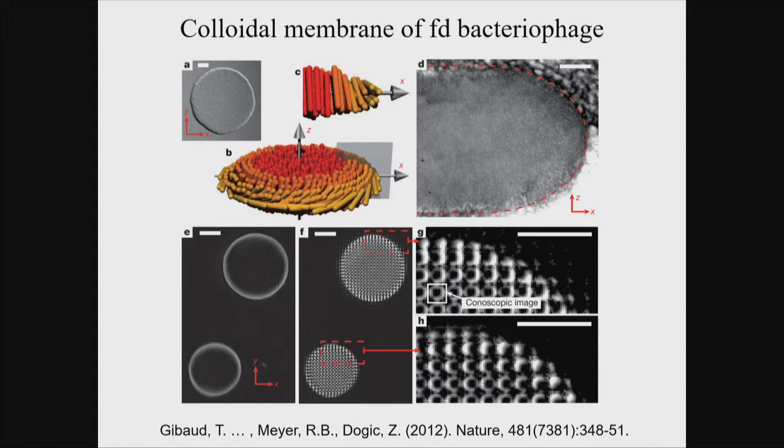You can change the focus of this data set, or you can change the perspective. You can seemingly move the object, or change the viewing angle in the image that you create on the computer. So you have a 3D data set, a 3D volume. And that's the same type of technique, this light field imaging.